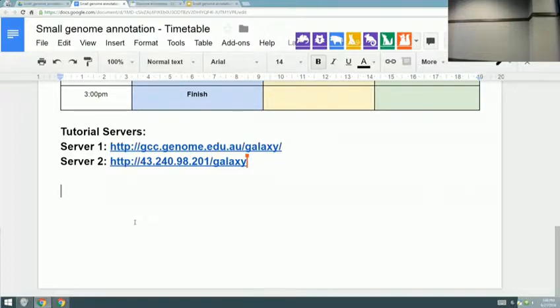You need to register on the server that you can use, on the top. Yeah, and then register. Doesn't really matter.